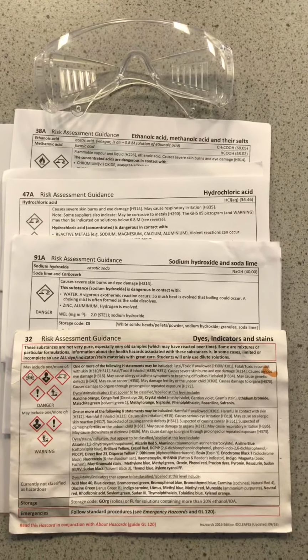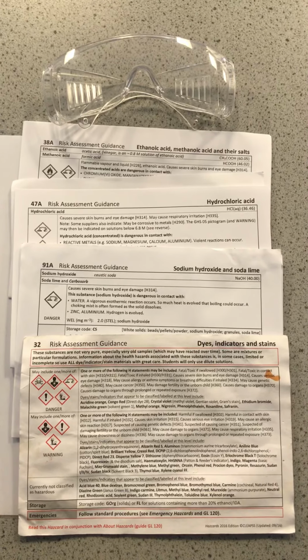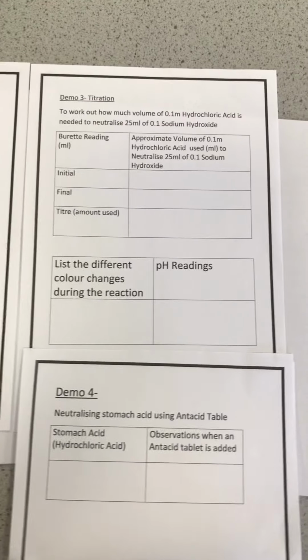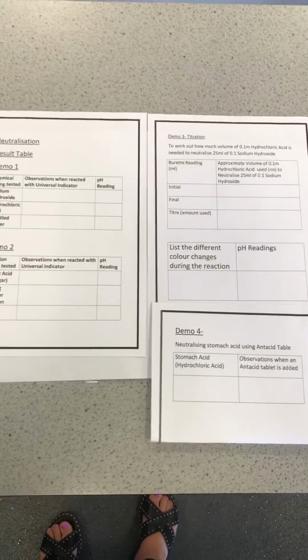We have done our risk assessment and we have realized we need to wear goggles throughout these experiments. You can record your observations on this worksheet. If you don't have one, your teacher will pause this video now so you can draw this table in your exercise book.